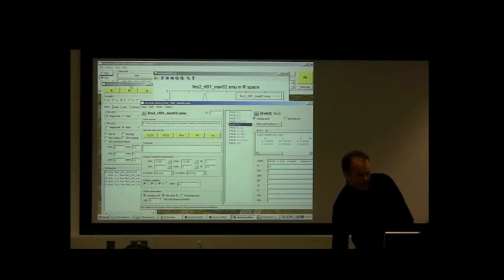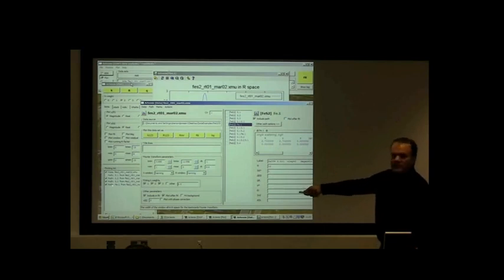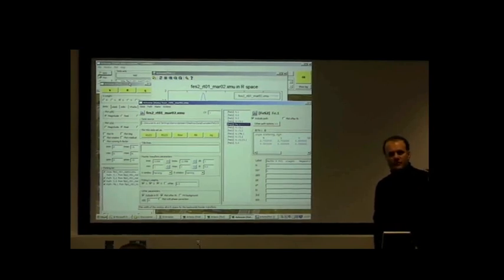I did that by clicking on each one successively and then clicking on that button. That moved each of those paths down into this list over here. So now when I click the button, the data is going to be plotted along with the contribution from the second shell sulfur, the third shell sulfur, and the nearest iron scatterer. Let's see what that looks like.